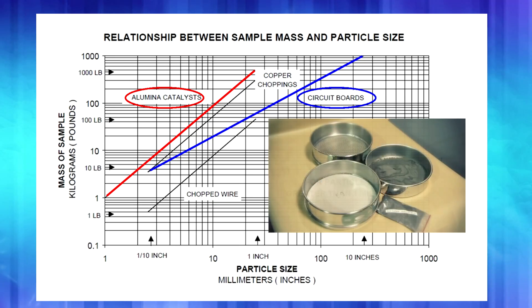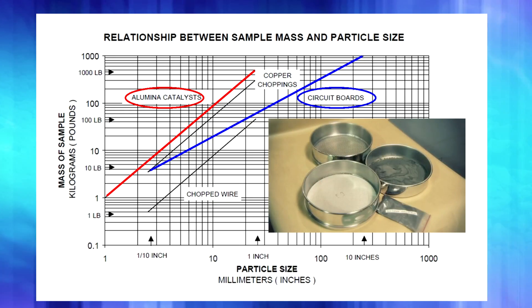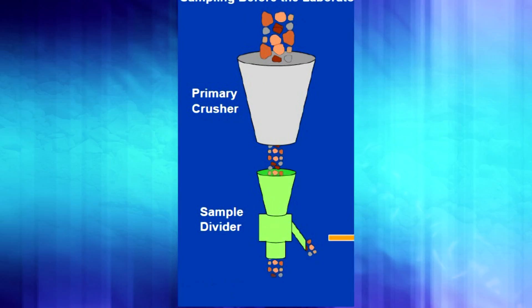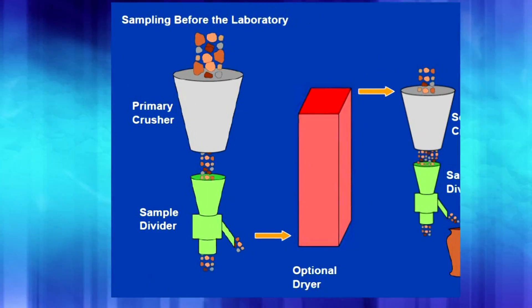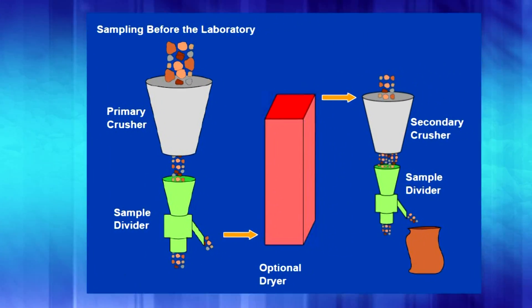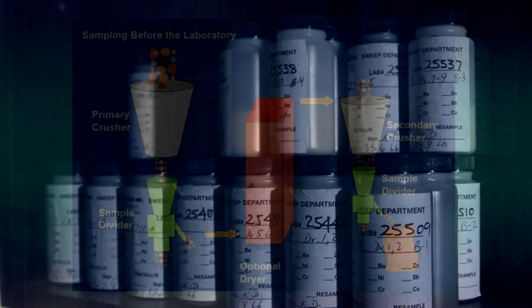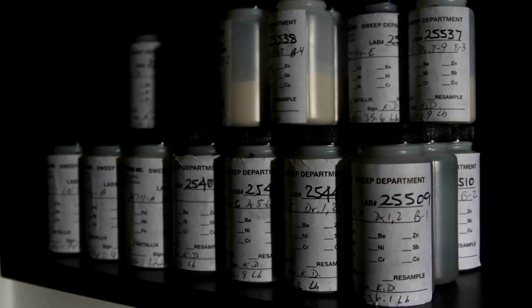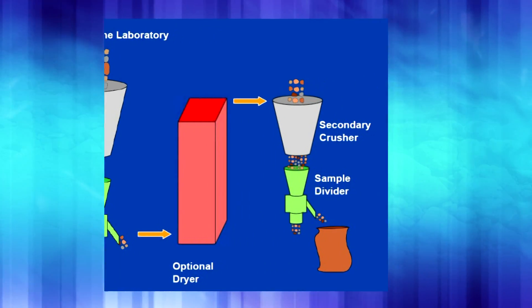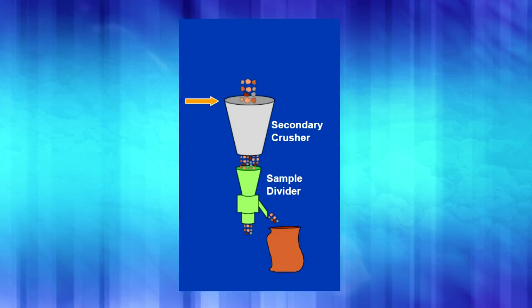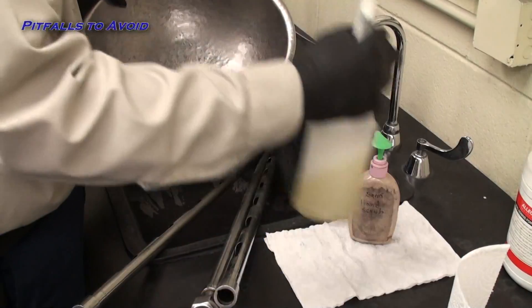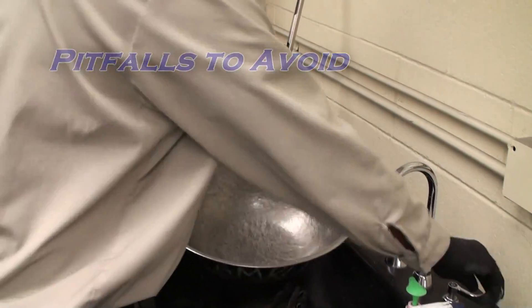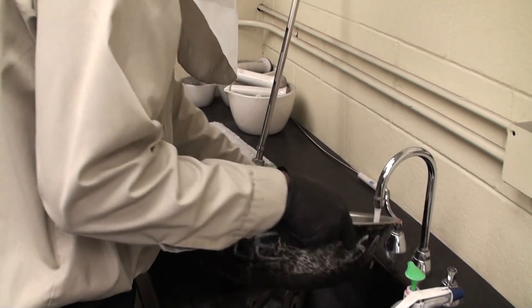Milled, blended, and split test samples are taken from lots and sent for analysis. Assay samples are then taken from the test samples, which typically require further grinding and splitting. There are a number of traps that can produce misleading results that care and handling should avoid.